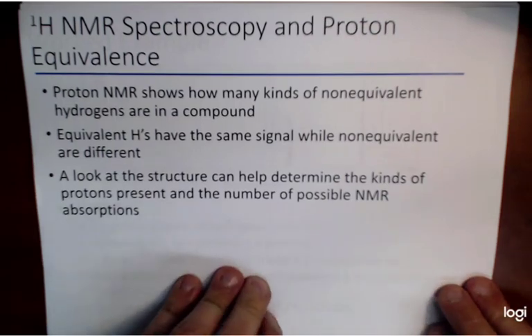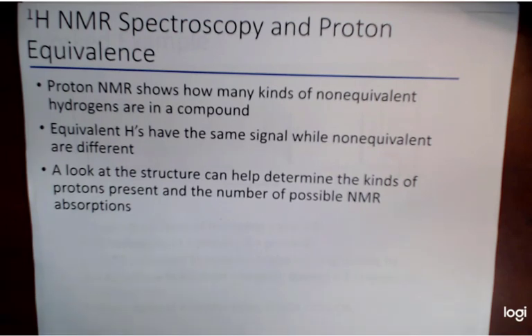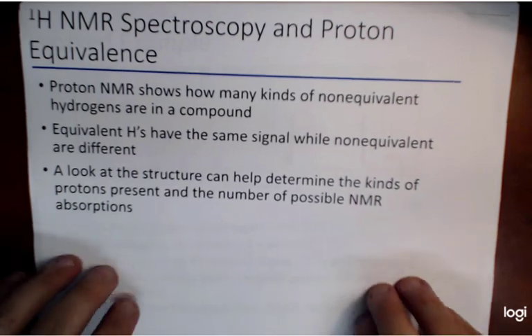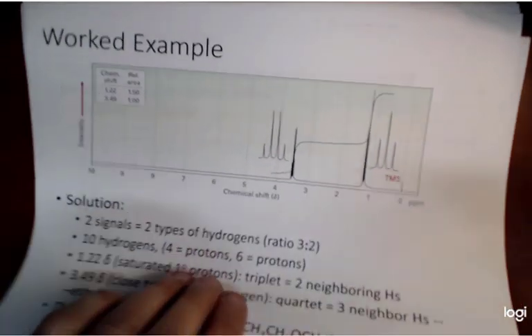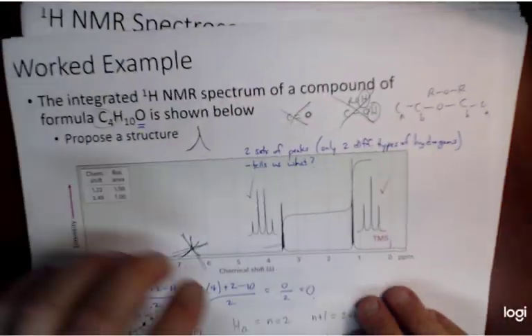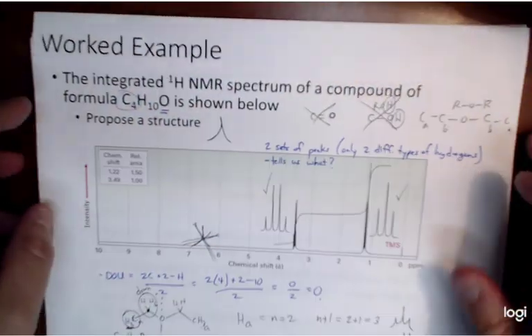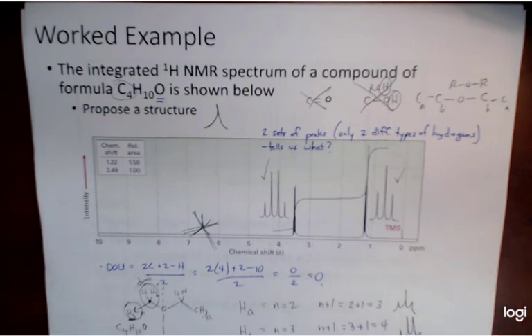Hello, we are starting our third installment for NMR. Here I have a worked example ready to go. Based off of what we've talked about so far with splitting, and understanding the environment and electronegativity, we are going to look at this worked example.